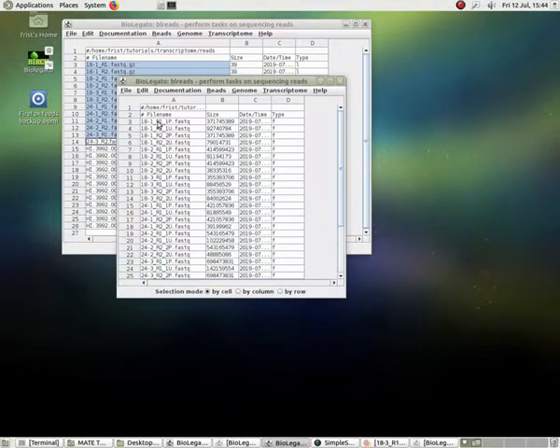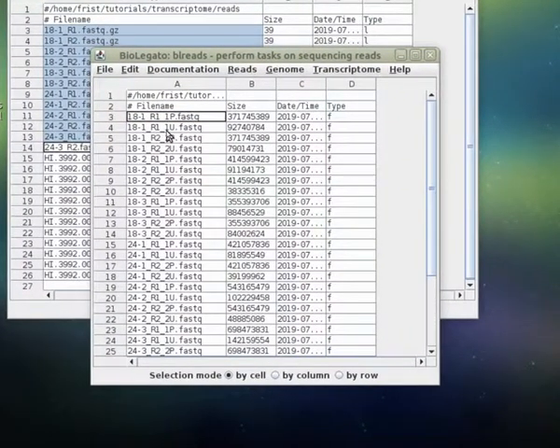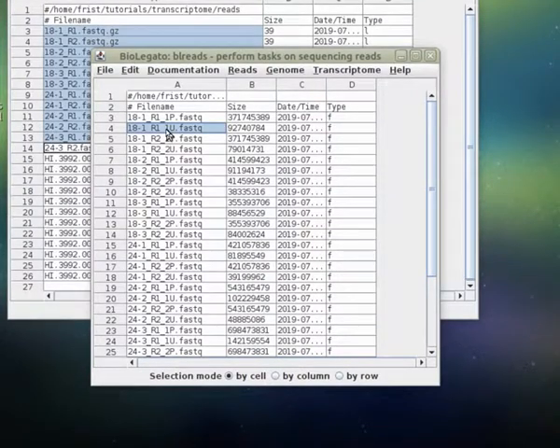So Trimmomatic will separate out the reads based on whether both reads in a pair, forward and reverse, are present. Those files end in a P, and if they end in a U, that means that there were unpaired reads. You're missing one of the two reads, and those missing reads can often mess up assembly programs.